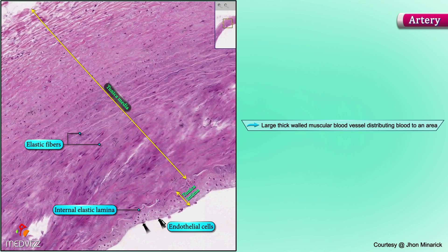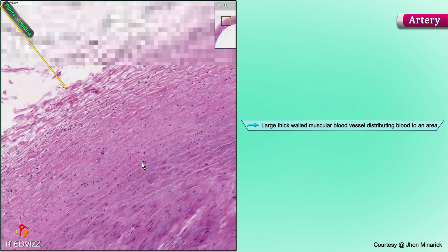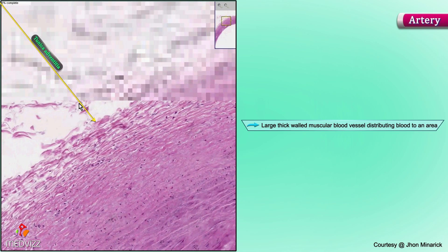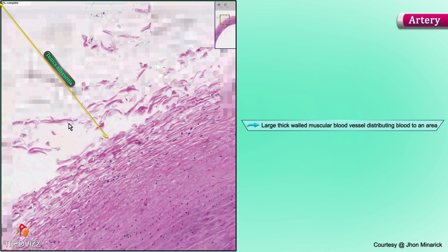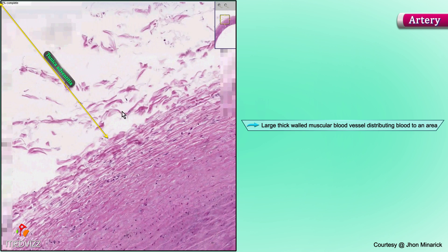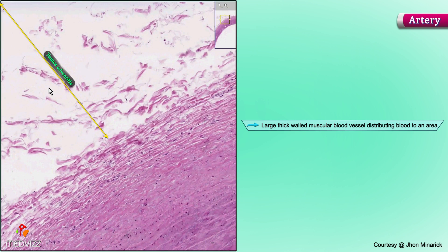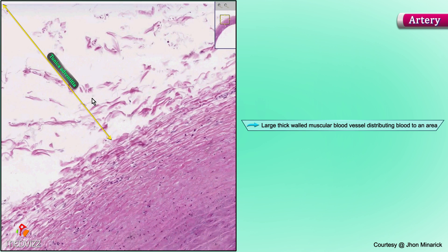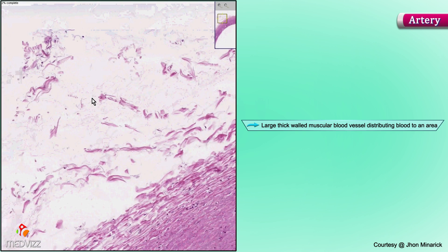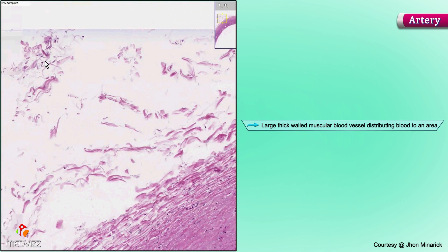Everything deep to that towards the lumen is the connective tissue of the intima. And if you're lucky, you could see individual endothelial cells lining the lumen. In the loose connective tissue of the adventitia, besides having a classical appearance of loose connective tissue, you can see perhaps some fat, some other blood vessels. Let's see if we're lucky enough to find a nice vasa vasorum here — maybe not, but you can be sure that they're there.